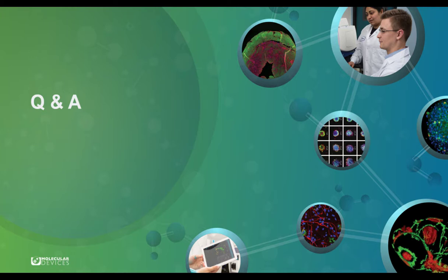Yep. Thank you, Dr. Tang. Our next question. How many maximal data files can be analyzed in batch analysis?